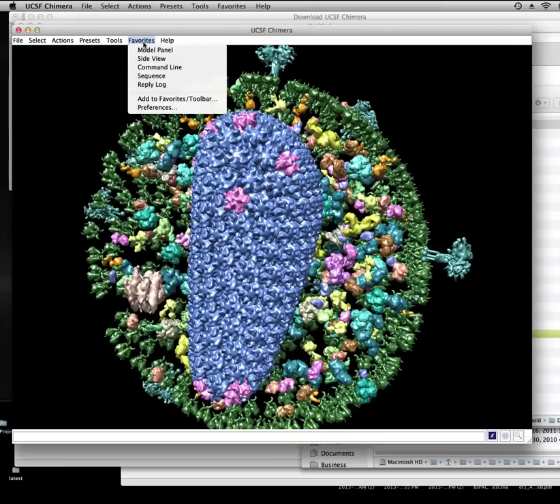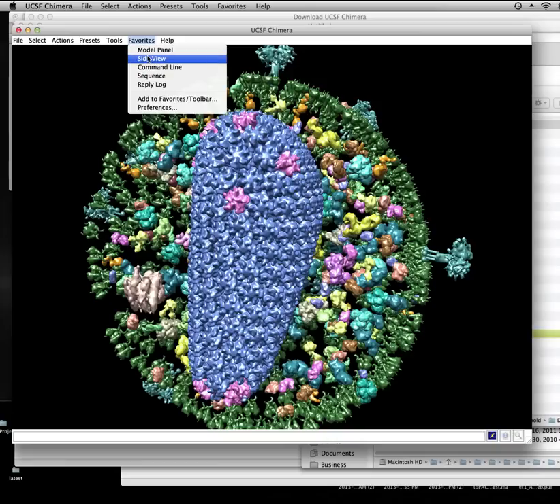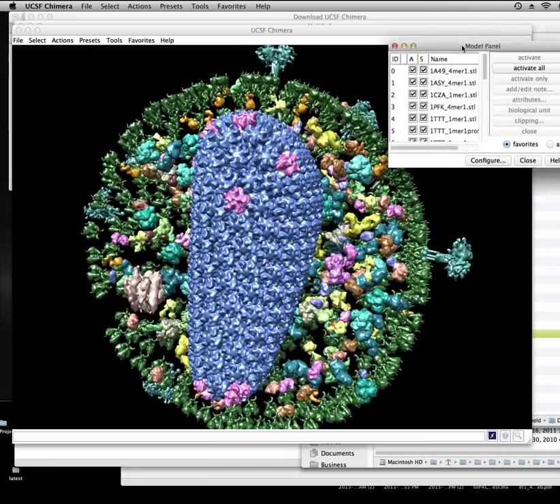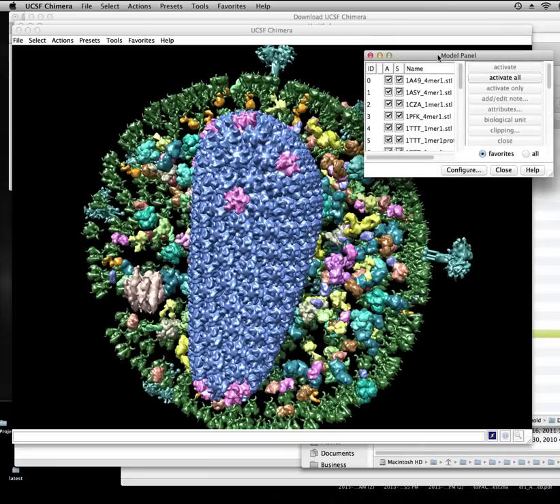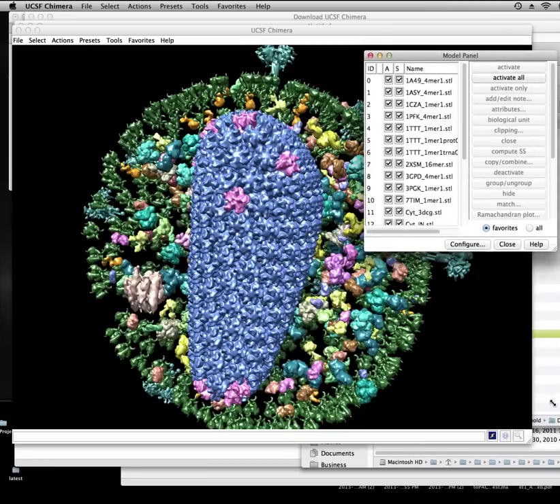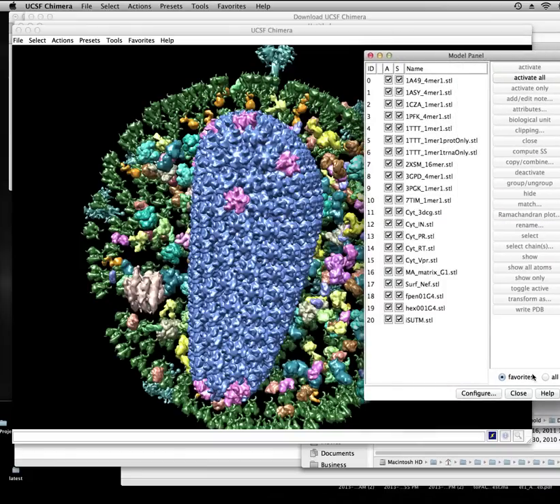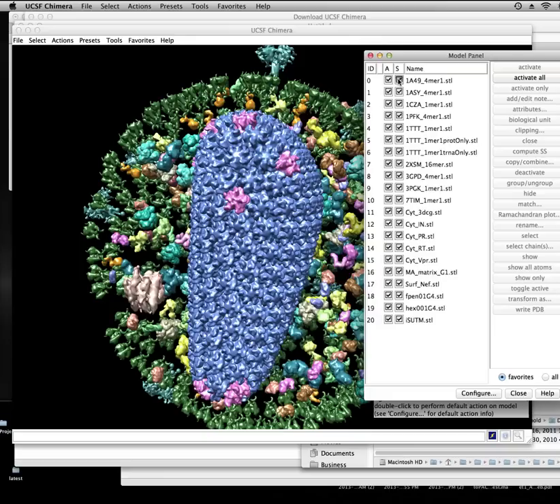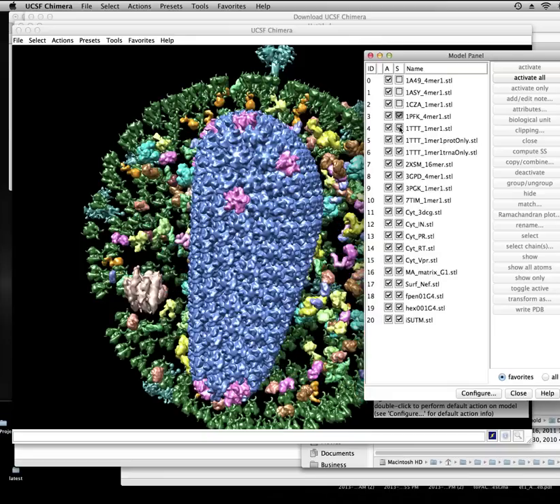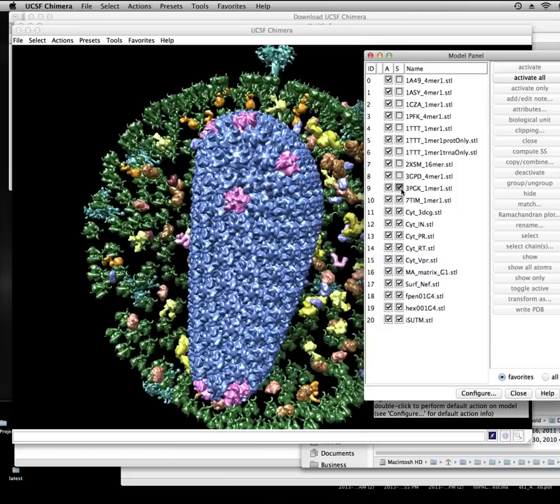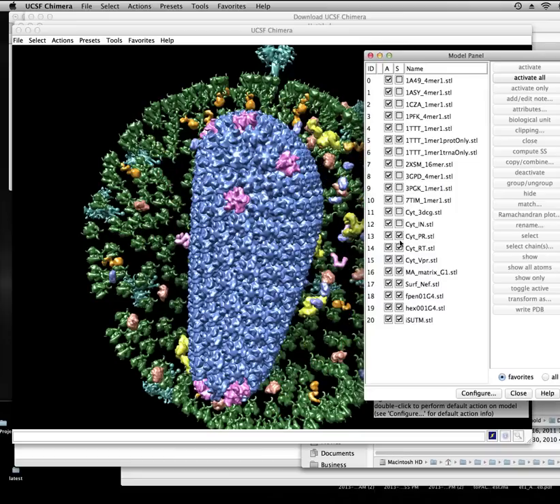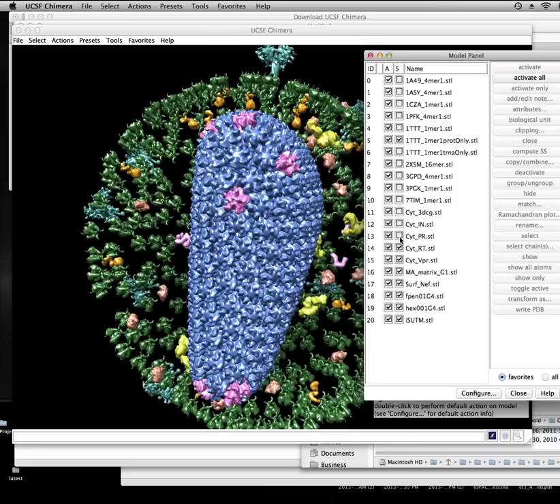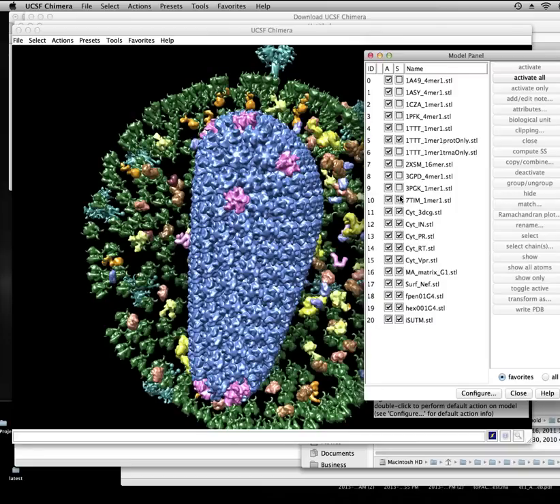So in Chimera, I'm just going to use some of the really common panels here. The model panel is probably the most informative in terms of telling you what's in your scene. We could just walk through and turn off all these elements if we wanted to. For example, let's turn off a big one, Matrix proteins. I'm going to turn everything back on.